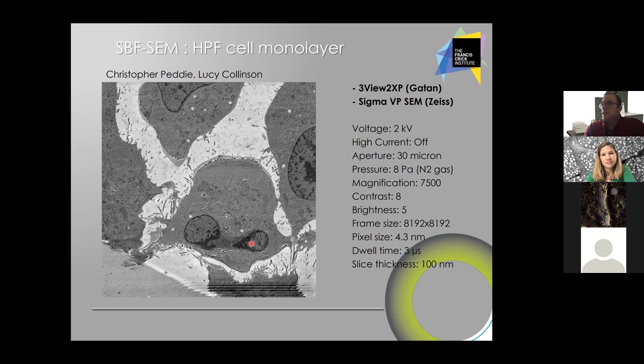And so this is the kind of images we could obtain from the volume electron microscope. And this one, you have all the parameters on the presentation here, and again, you will be able to look at them again. These parameters are always given with the user note we send when you are using the resin. But obviously this is subject to evolution, and this is not an absolute estimation. Your microscope might behave differently. That's quite important to keep in mind.